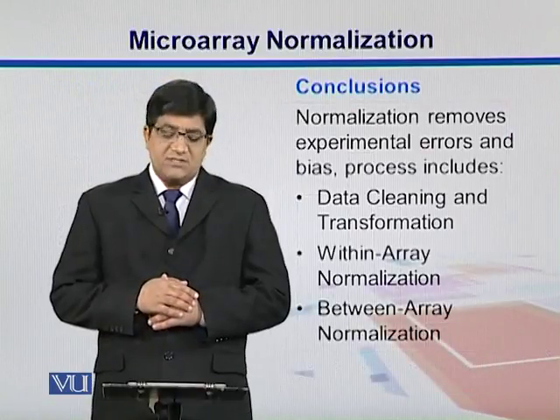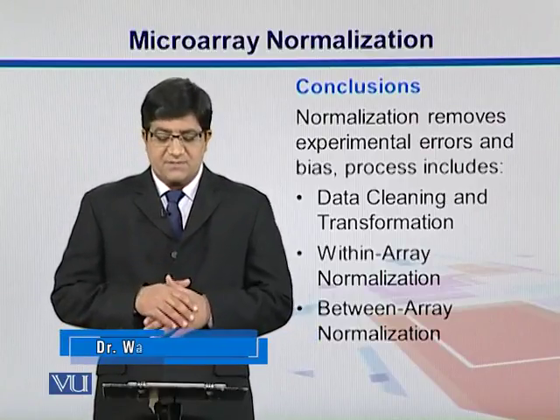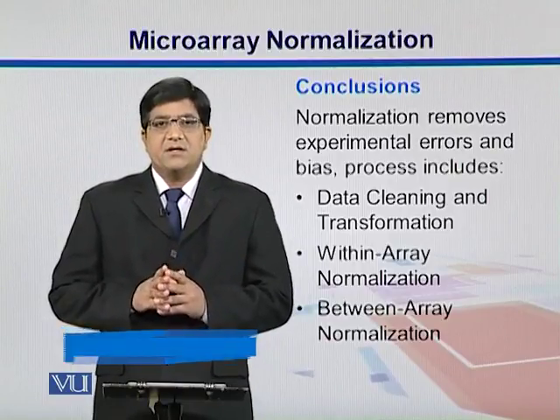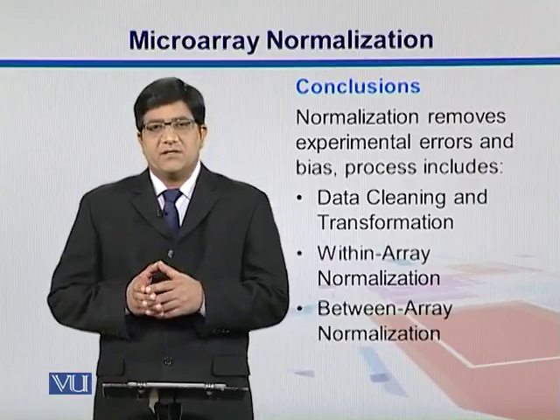So we see that normalization in the experiments removes experimental errors and the bias which arises, and this process includes data cleaning and transformation. There is within-array normalization and there is between-array normalization.